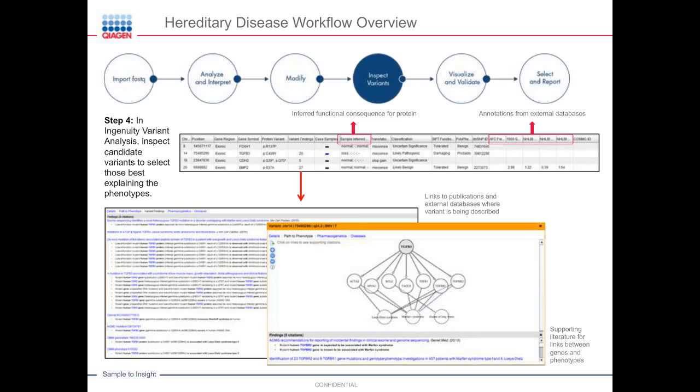And the other part, and that is also where you can filter down to such a low number, is by using the knowledge base with the literature curation and the ontology in it. You cannot do that if you don't have the knowledge base.